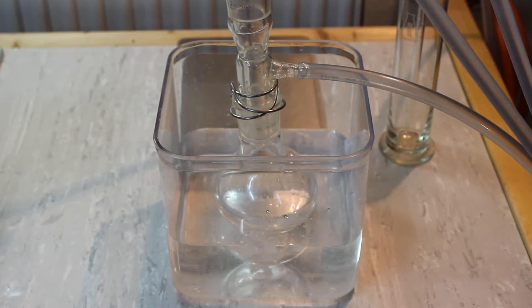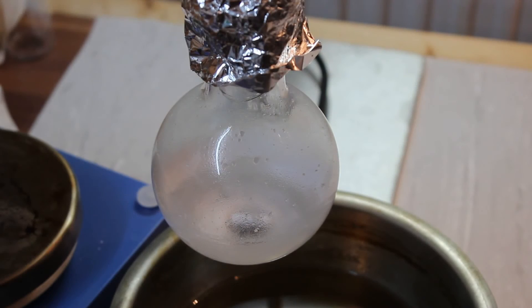The ethyl bromide is currently coming over at exactly 38 degrees Celsius. The distillation is finished and here you can see the remainder in the boiling flask. I pretty much distilled until dryness and all the product came over at a constant 38 degrees Celsius.